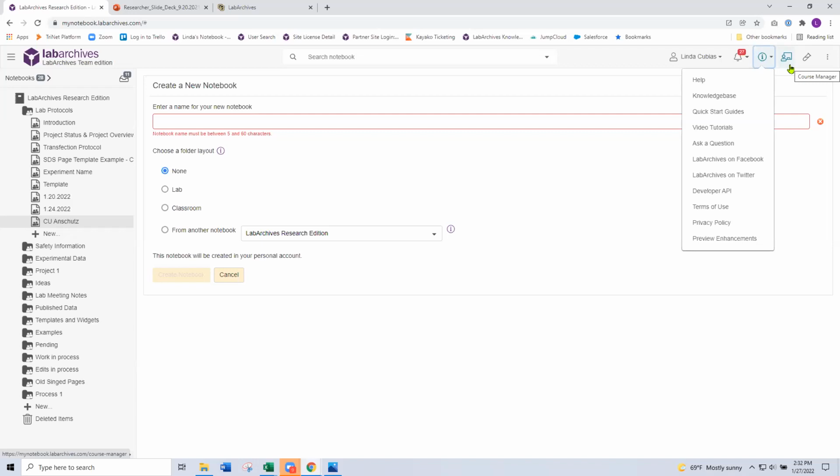There's another product that LabArchives supports, and that we also make available for sale. And that's our inventory tool. This is not currently part of your license, but if you were ever in the market for an inventory tool to manage your lab inventory, if you selected that icon, it will prompt you to create a 30-day trial.